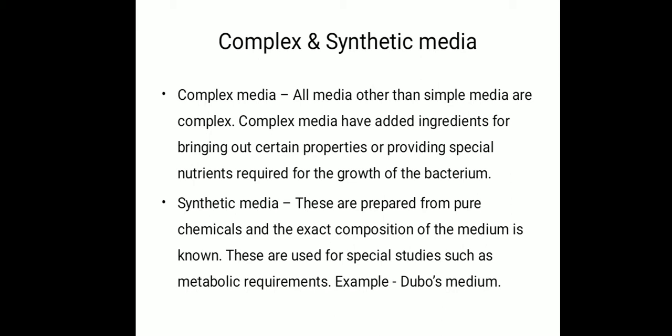In the case of synthetic media, these are prepared from pure chemicals and the exact composition of the medium is known. These are used for special studies such as metabolic requirements, and an example under this is the Dubos medium.